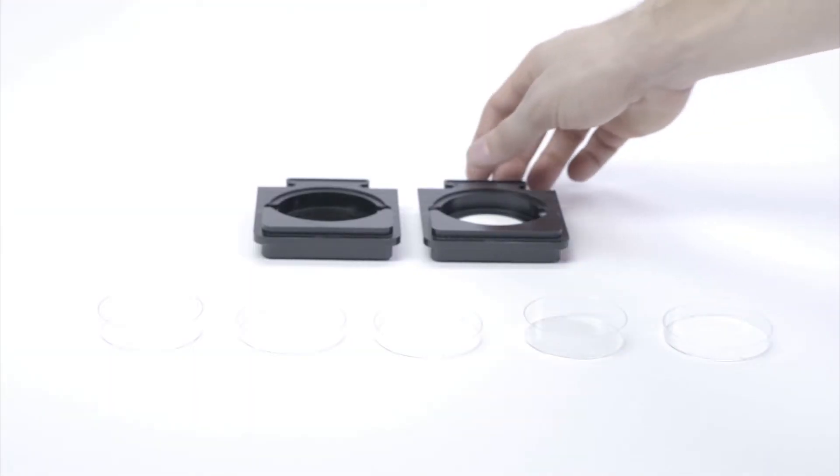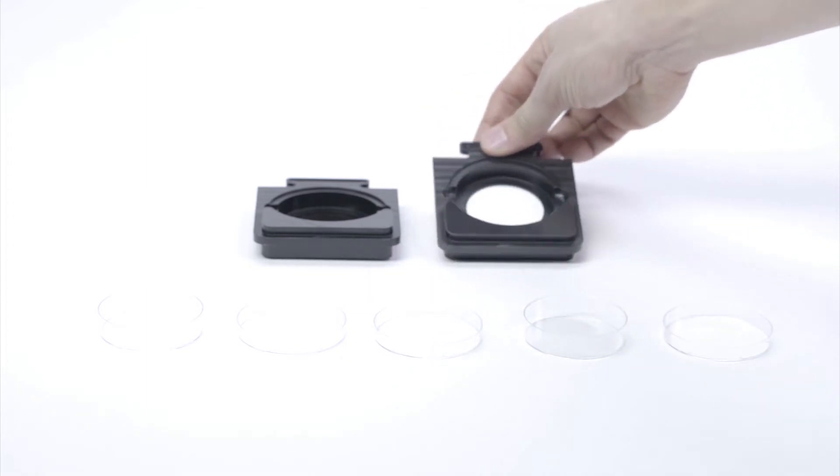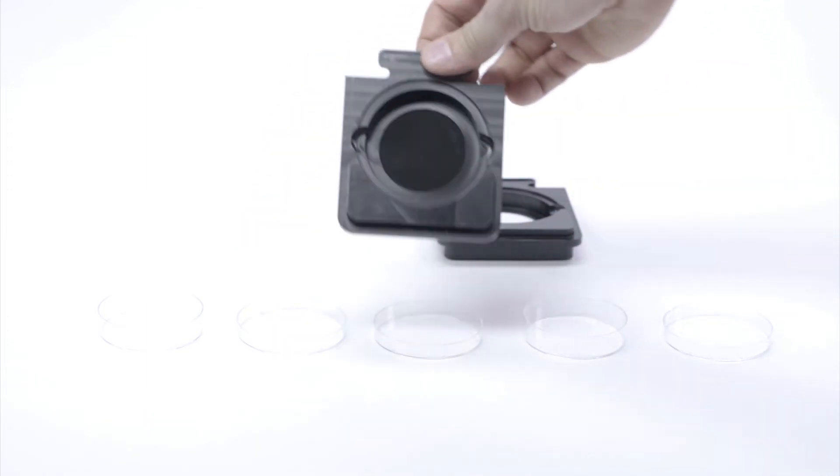One sample holder has a white background, and the other one has a black background.